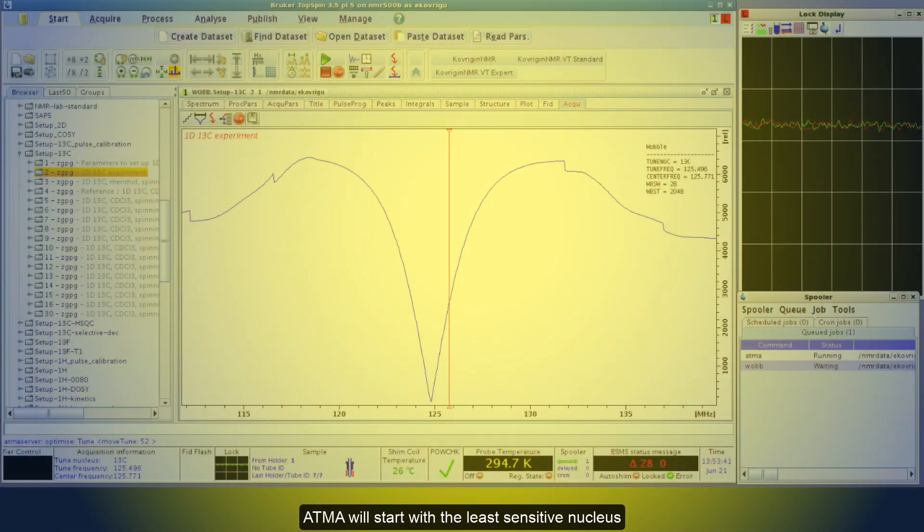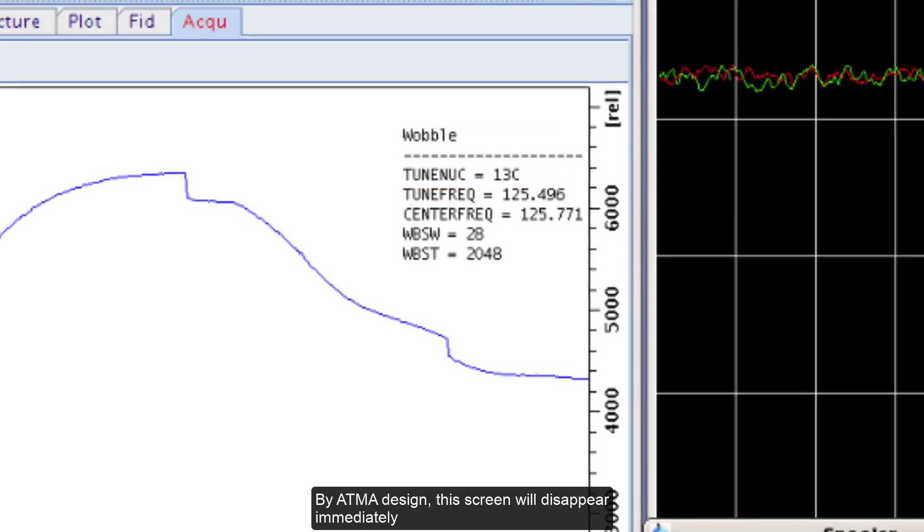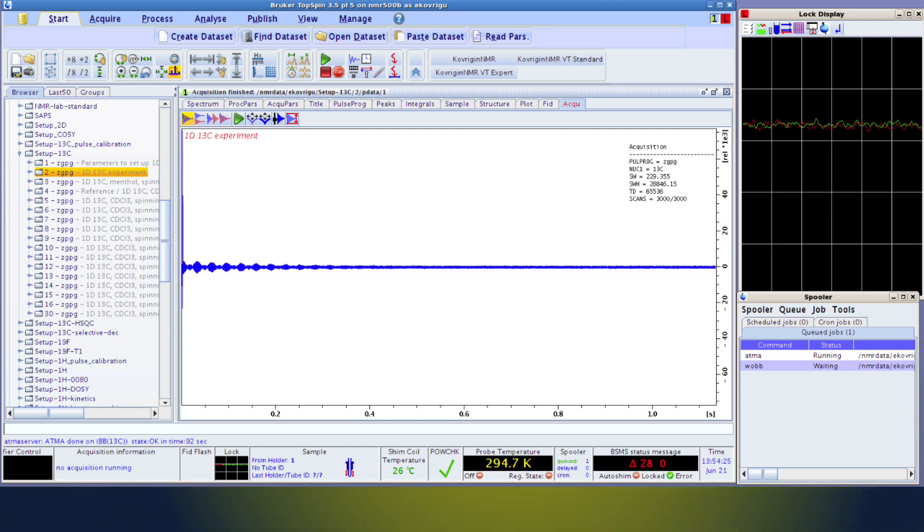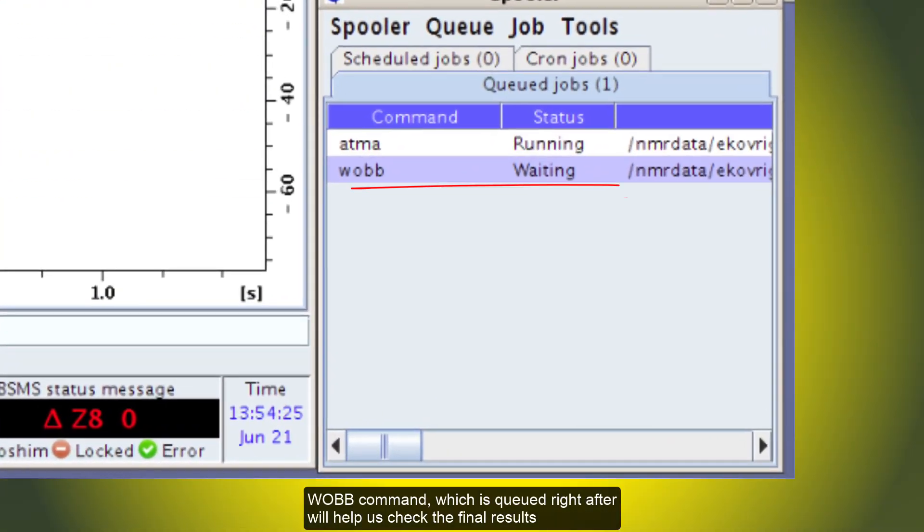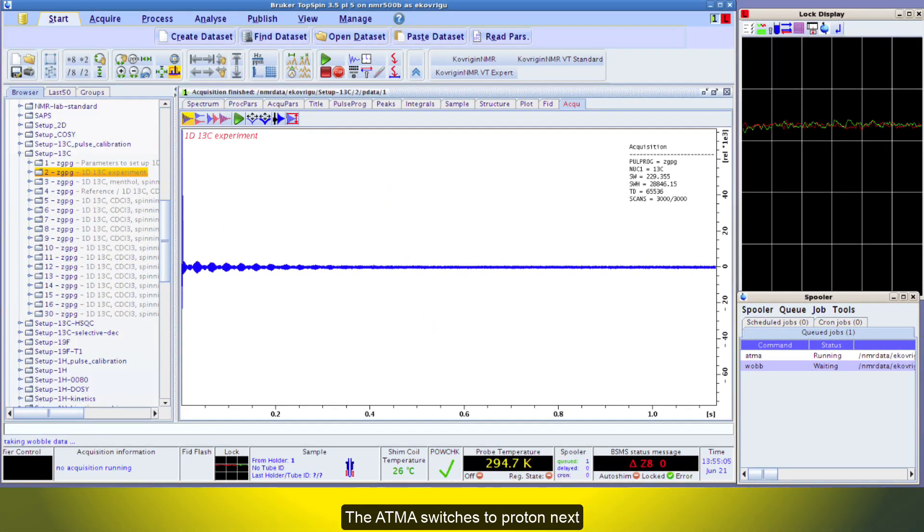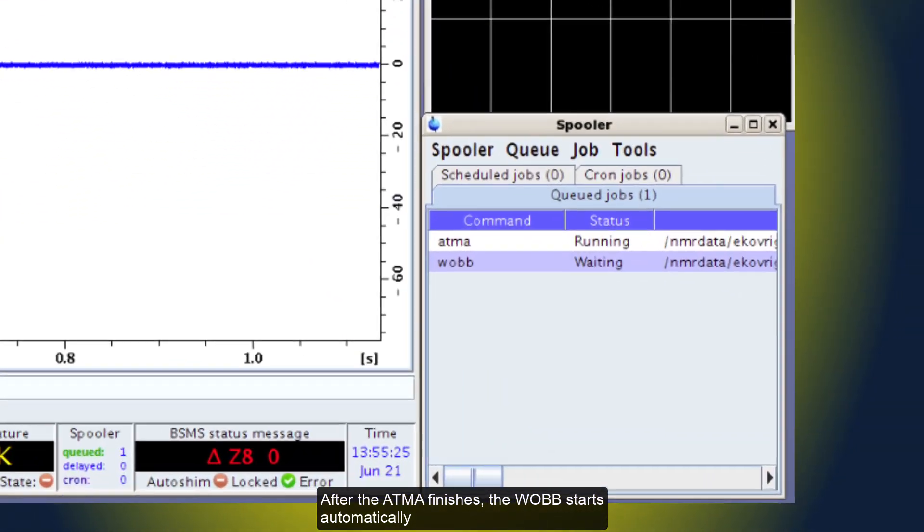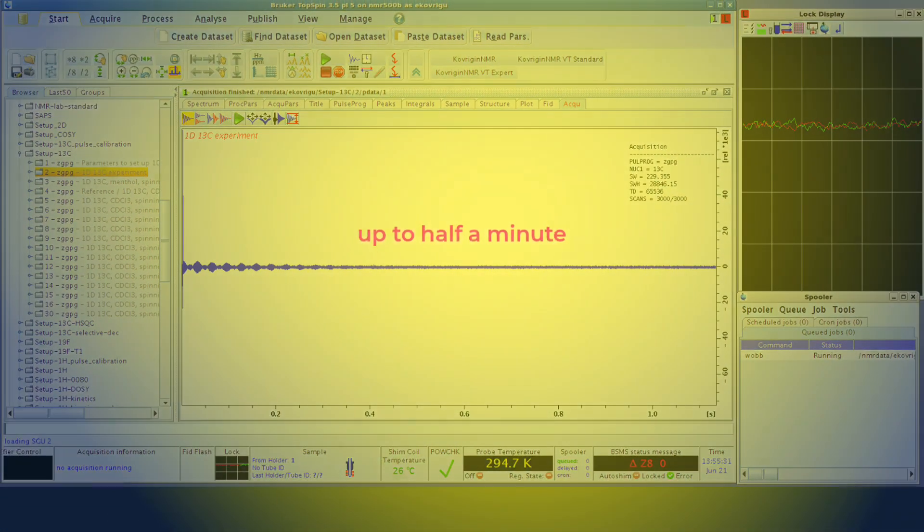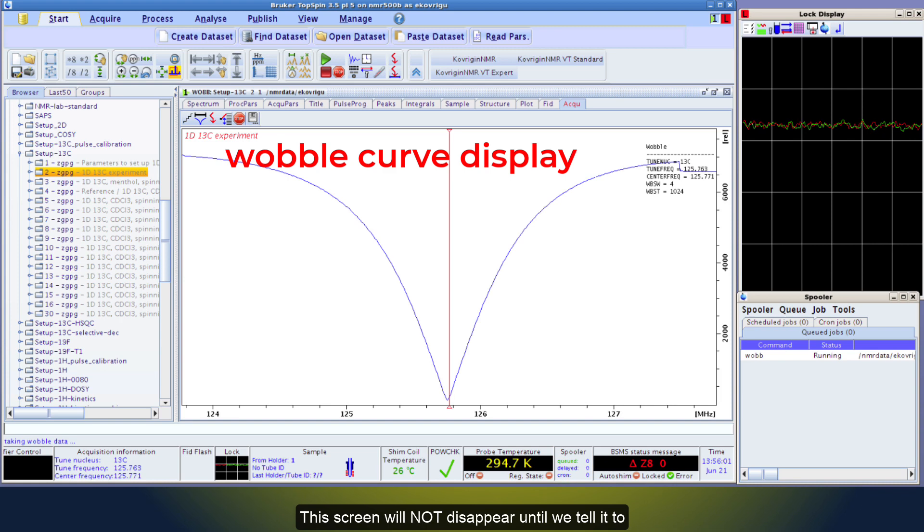The ATMA will start with the least sensitive nucleus, which is carbon in my case. By the ATMA design, the screen will disappear immediately, as the ATMA finished with the nucleus. Therefore, the result is often easy to miss, but no worries. Wob command, which is queued right after, will help us check the final results. The ATMA switches to Proton next. And after ATMA finishes, the Wob starts automatically.